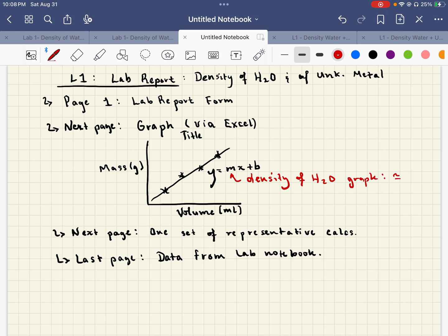And that should be approximately one gram per mil. If it's not, then you've forgotten to subtract the mass of your empty beaker from the rest of your beaker plus water values. And I'll show you that in a minute.